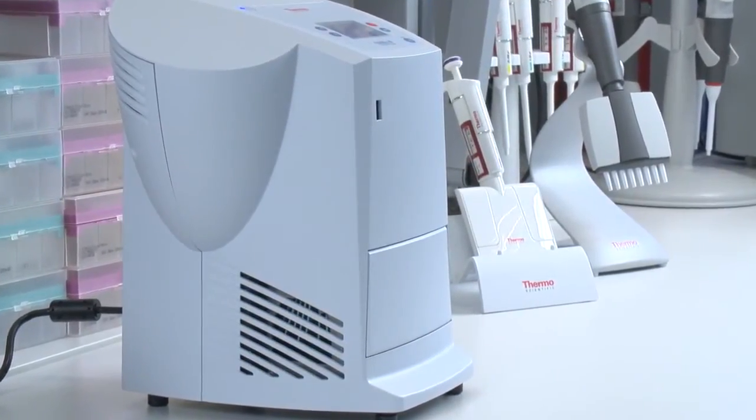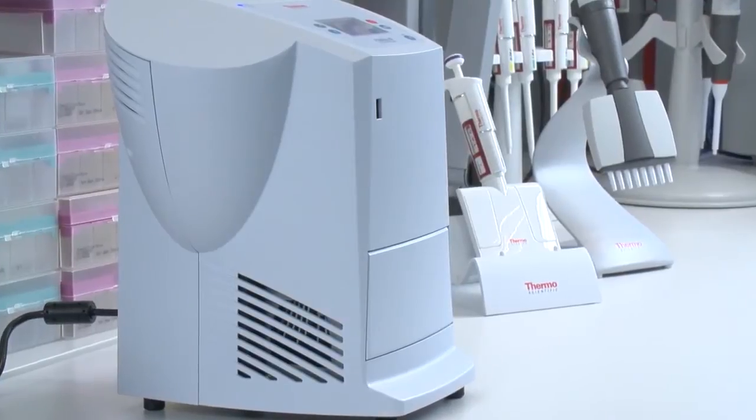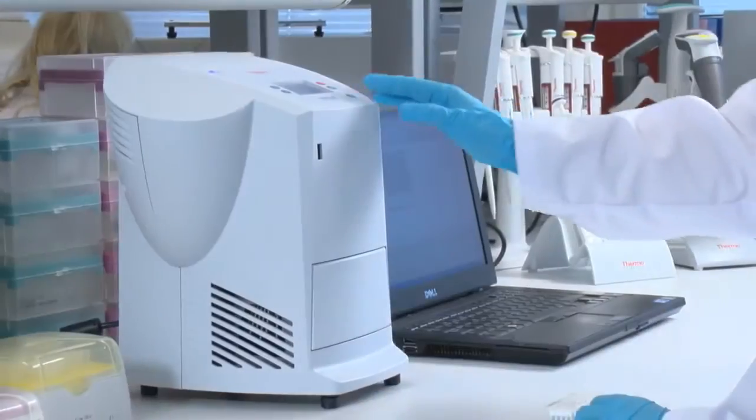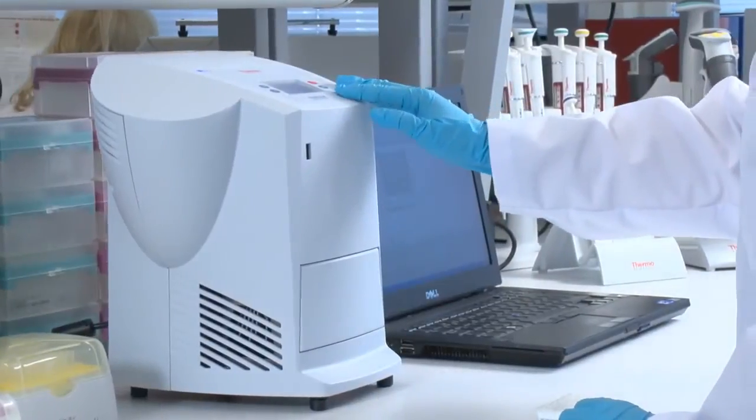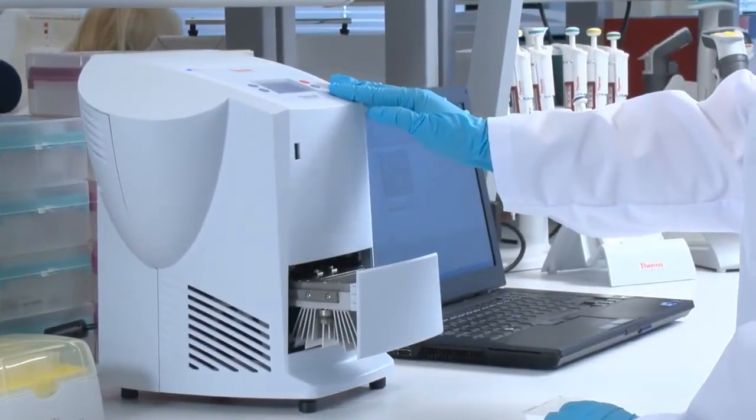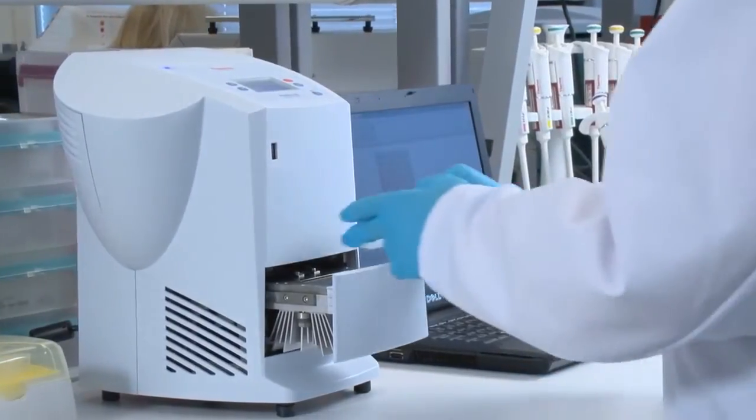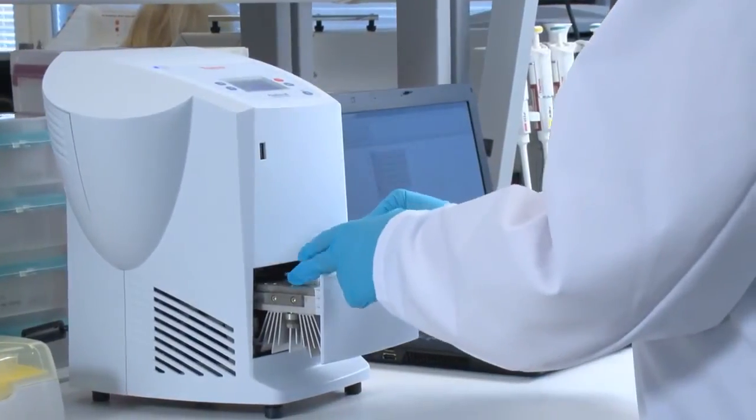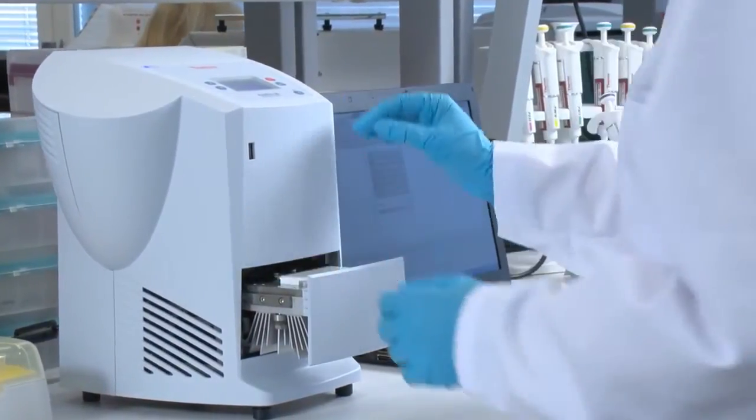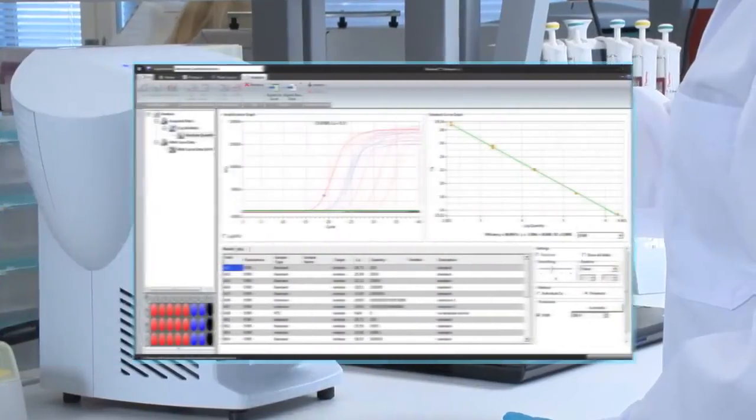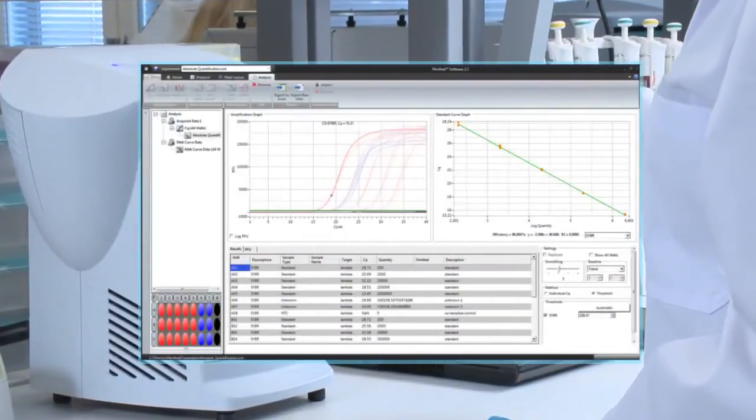ThermoScientific PicoReal real-time PCR system is controlled with the ThermoScientific PicoReal software. It offers the user an intuitive experience from programming protocols to assessing experimental results.